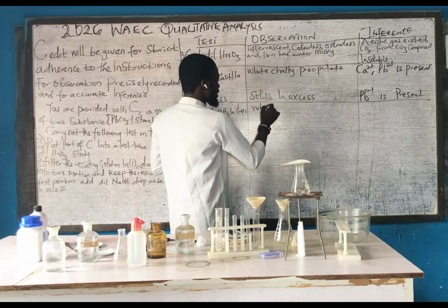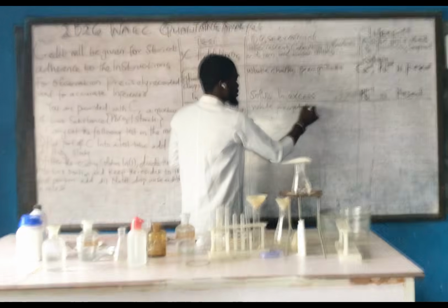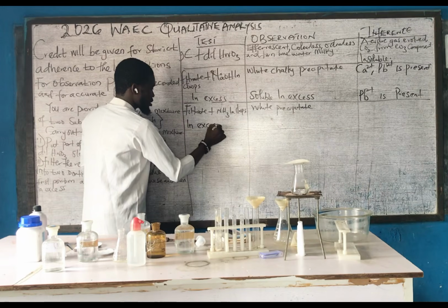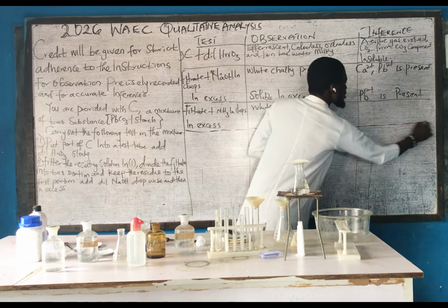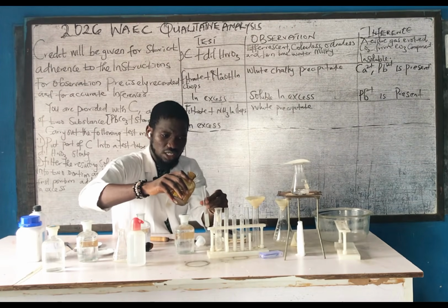I have white precipitates. Now, in excess, so let's have it in excess.